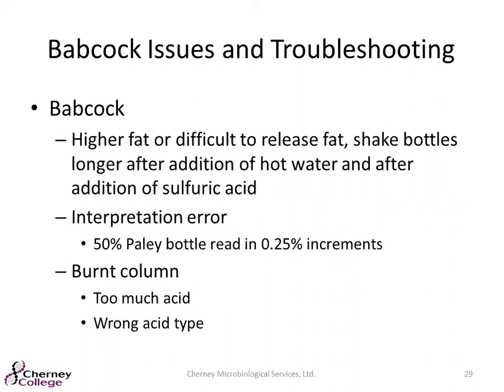Simple test, but it can be hard to read these. So making sure that you do have the appropriate equipment, and if you've got somebody tall reading them versus somebody short, making sure that you've got a good space for everybody to be able to do that at eye level. And then making sure that you add the right acid, not too much, not too little, and not interpreting burnt columns, making sure that if you recognize a burnt column, you start over.